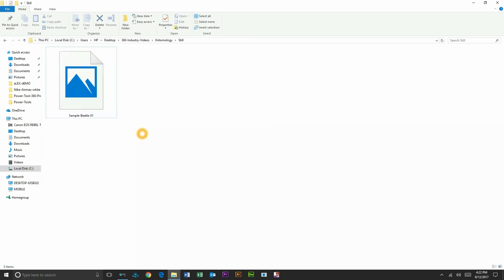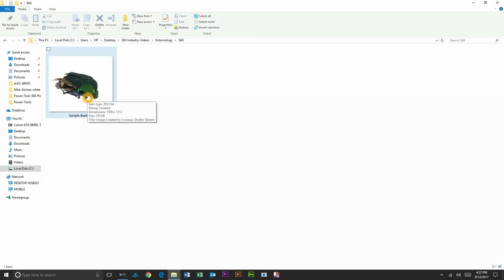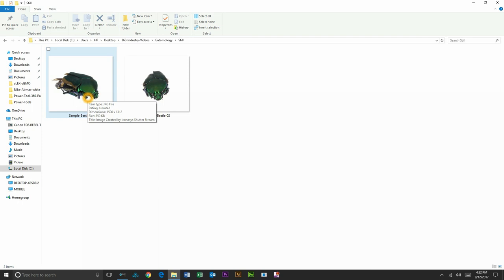Let's go ahead and inspect all these images, and we can see it's outputting all these images again, resized to 1500 pixels wide.